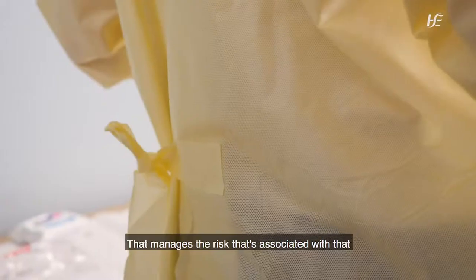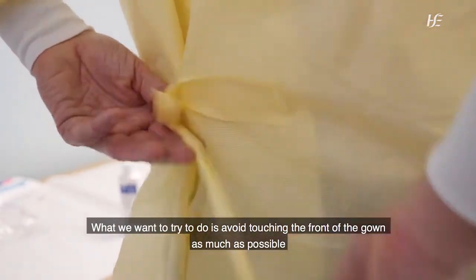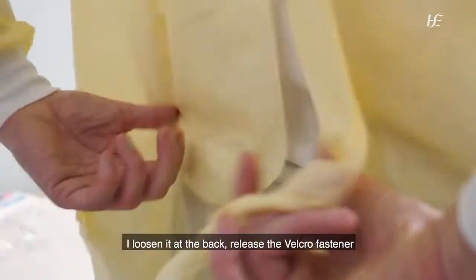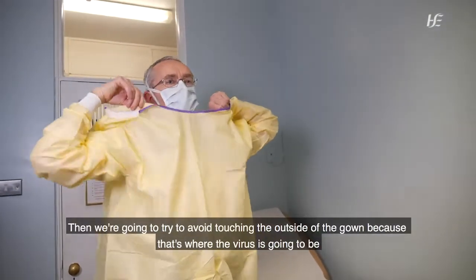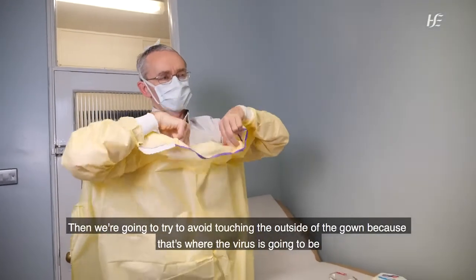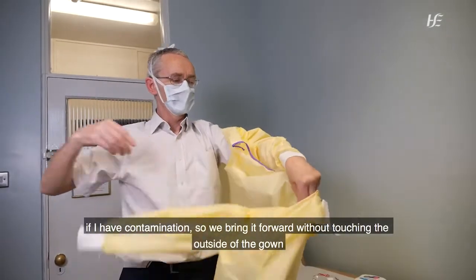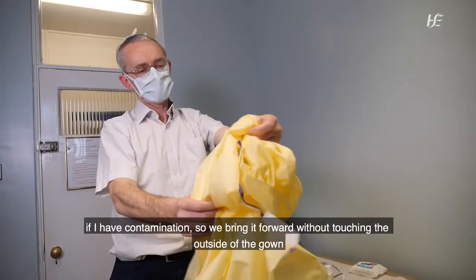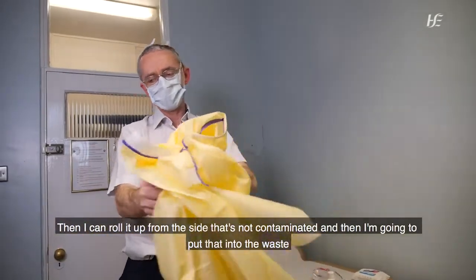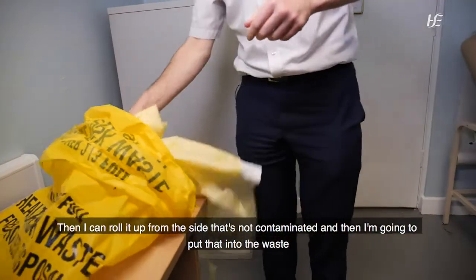Okay, so now we're going to take off the gown. So what we want to try to do is avoid touching the front of the gown as much as possible. So I loosen it at the back, release the Velcro fastener, and then we're going to try to avoid touching the outside of the gown, because that's where the virus is going to be if I have contamination. So we bring it forward without touching the outside of the gown, and then I can roll it up from the side that's not contaminated, and then I'm going to put that into the waste.